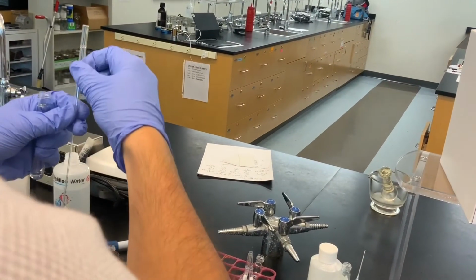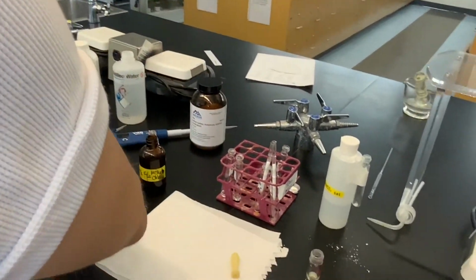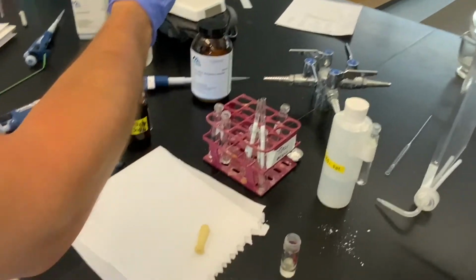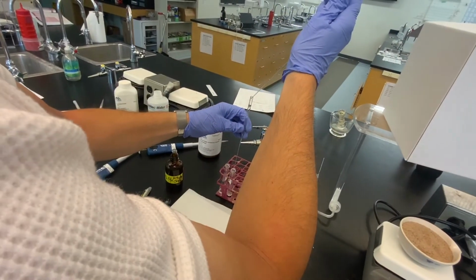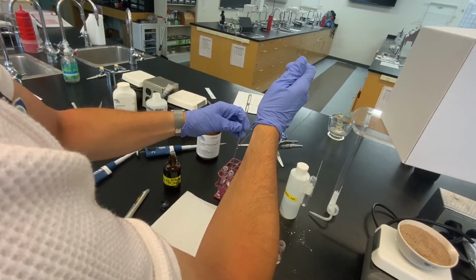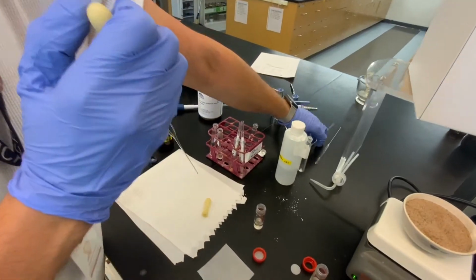However, still to be consistent with the experiment, we'll might as well just rinse the Pasteur pipette with small aliquots of methylene chloride to effect a quantitative transfer.